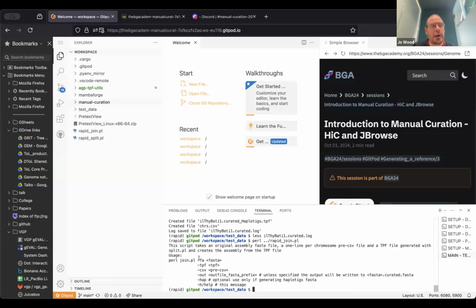As I said in the chat, we're currently migrating everything off of GitLab over to GitHub. When everything goes up on GitHub, and I'll spam various channels once that's up, there will be an updated version of the script that will allow you to produce multiple haplotype files at once.